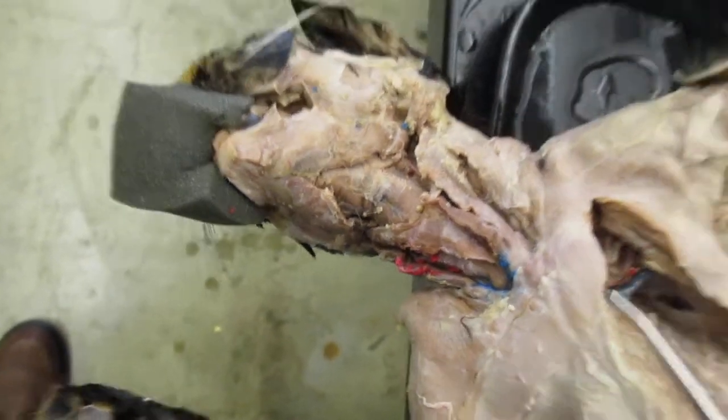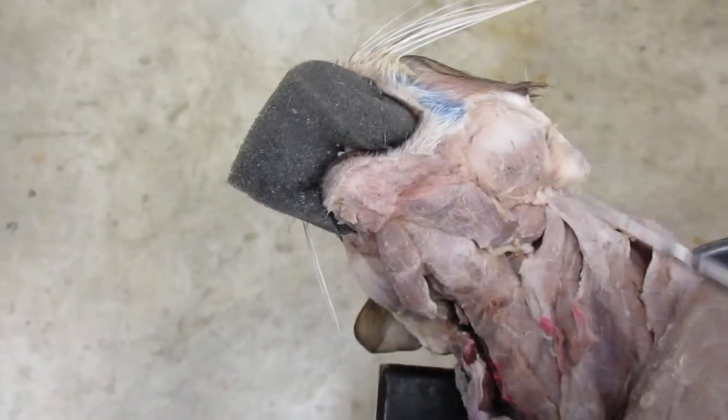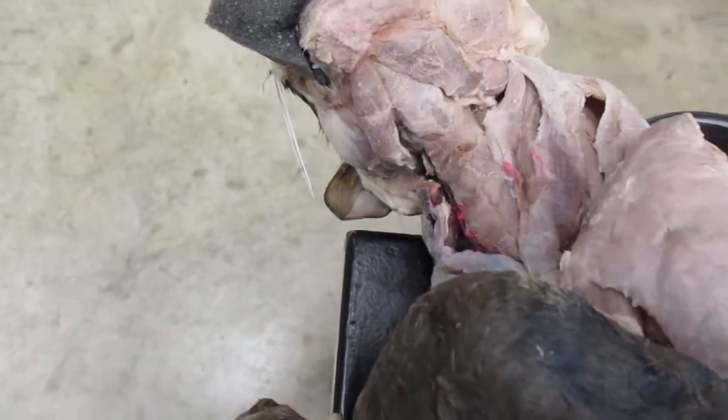And then over here, I want to show you this cat here. We can see the same thing here. We have the masseter. Let me make it clear. So we have the masseter muscle right here. We have the digastric muscle right here and right here. We have the mylohyoid right here.